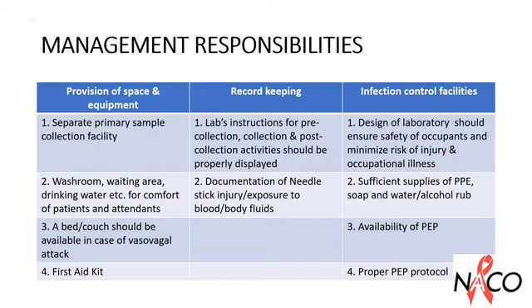The design of the laboratory should ensure safety of occupants and minimize risk of injury and occupational illness. Sufficient supplies of PPE, soap, water, alcoholic rub should be ensured by the management. An availability of post-exposure prophylaxis and a proper PEP protocol should be in place.